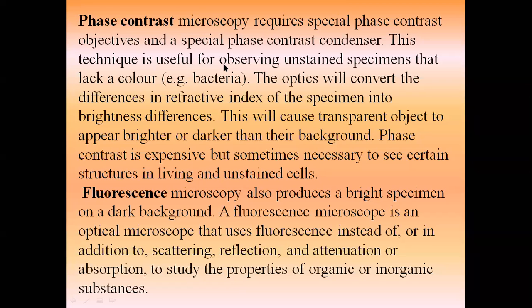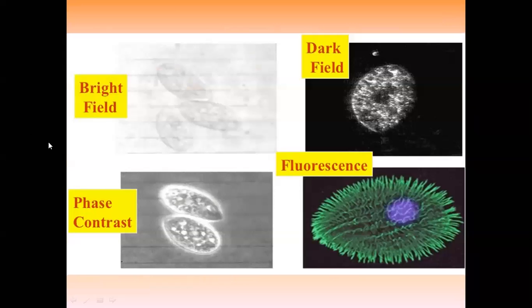That means in your fluorescence microscope, only those specimens which have the property to fluoresce, you will be able to see.